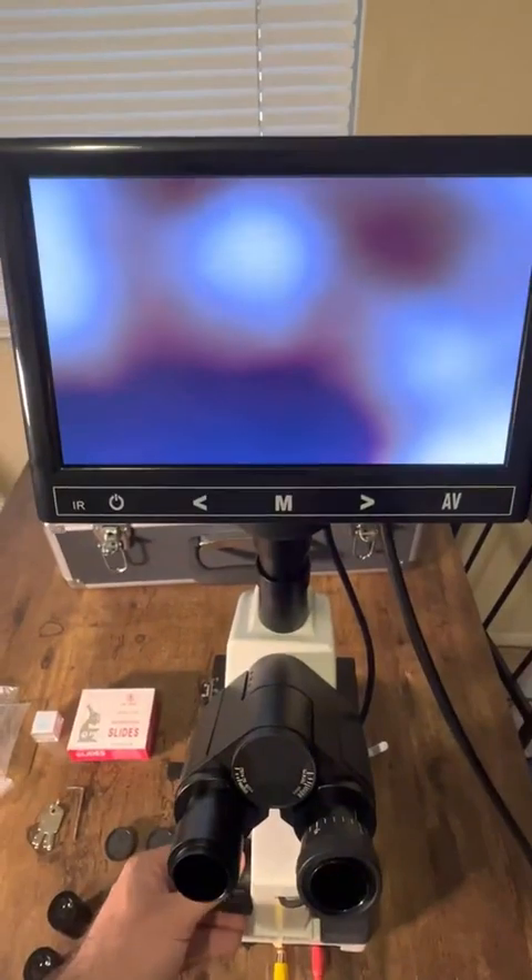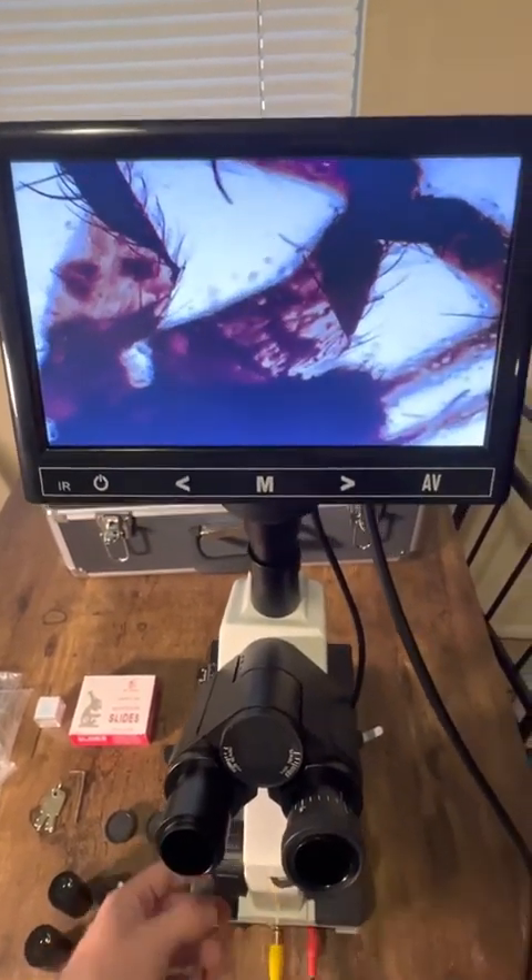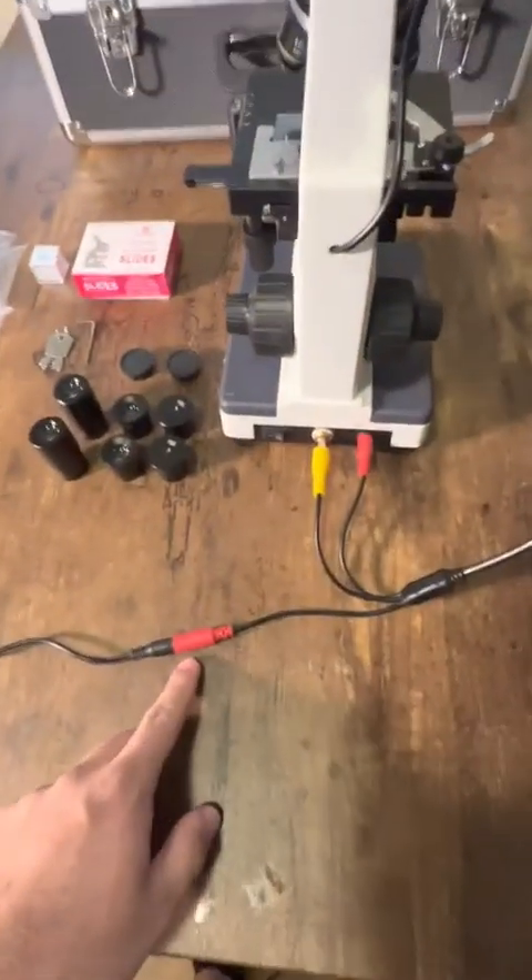You can even tilt it up and down, back and focus or not. Everything just works super well, super easy to hook up.